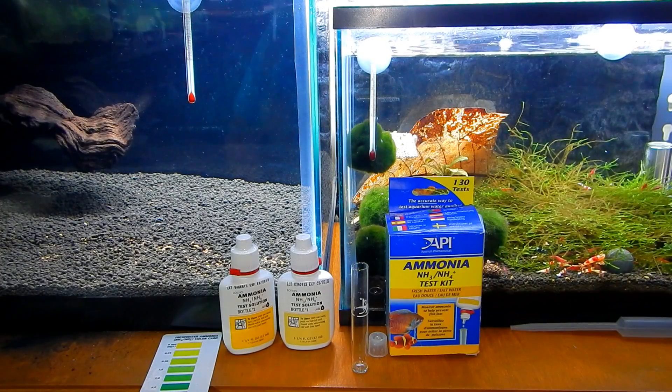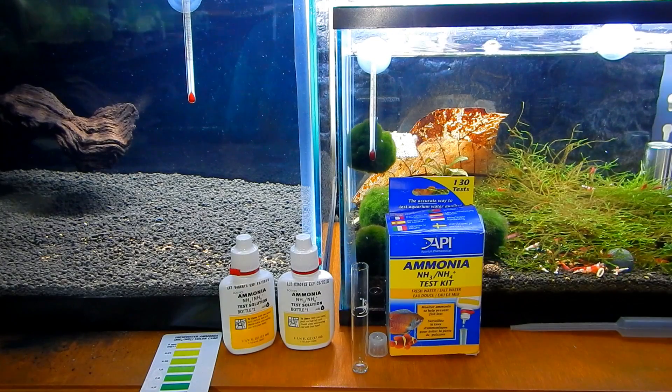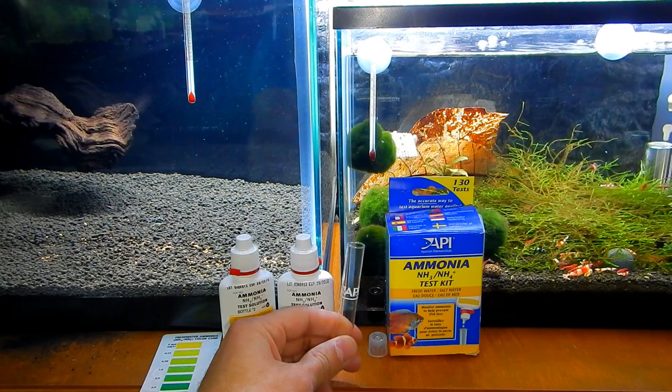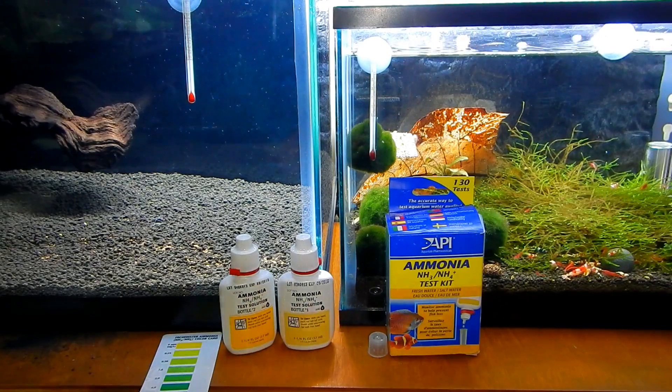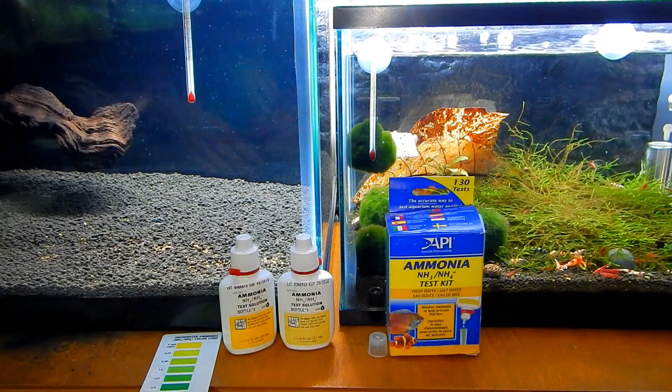For this test I'm going to be using the API ammonia test kit — it's not my favorite but that's what I have at the moment. I'm going to be using the test tube that comes with the kit, and before I even start the test what I like to do is actually rinse it with the water from the tank that I'm going to be testing.